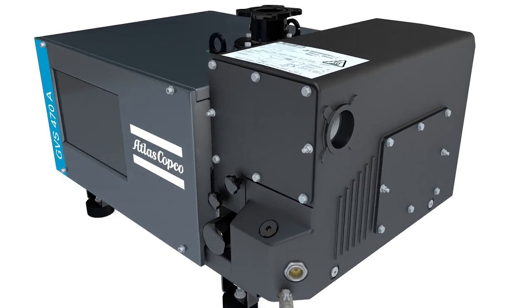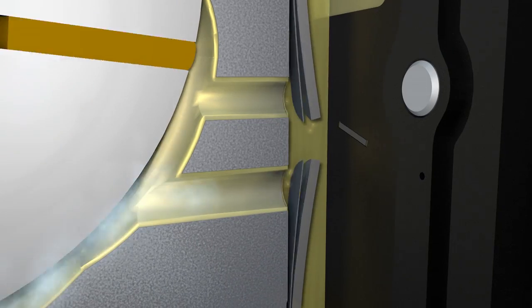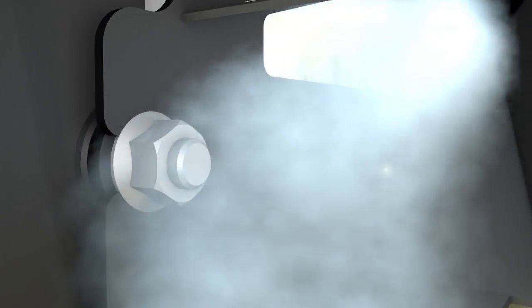The exhaust is equipped with valves to avoid backflow. The pressure builds up at the exhaust until it reaches the necessary overpressure to open these valves. Now, the gas is evacuated into the oil box.